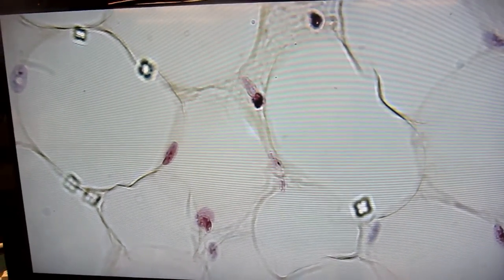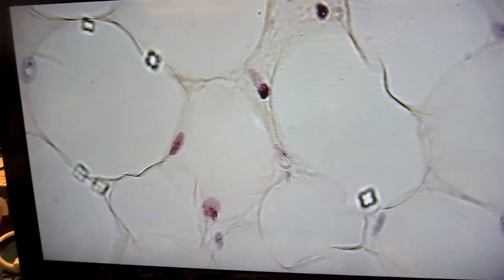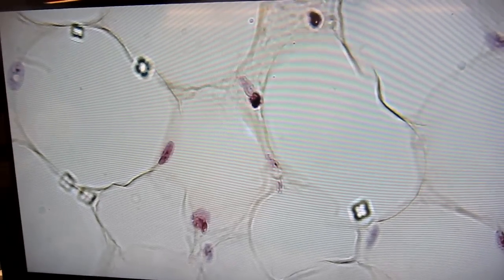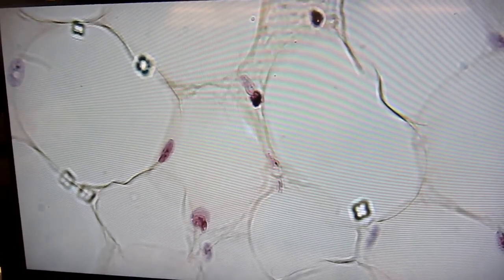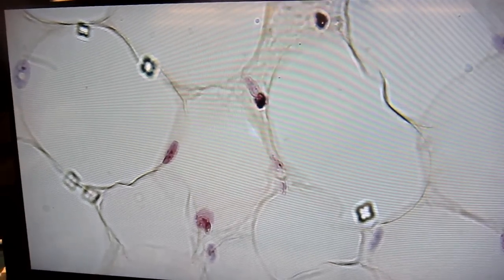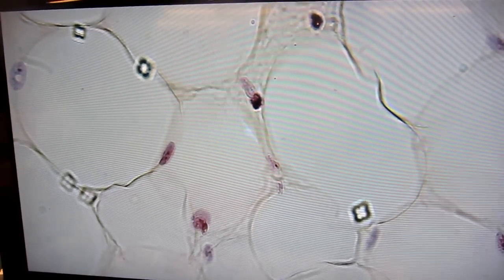Here's our second loose connective tissue. In this one you really don't see much in the way of fibers, but you can see that there are a lot of large swollen cells. It kind of has the appearance of bubble wrap, or some people think it looks a little bit like chicken wire.